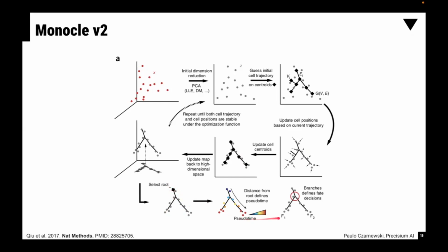And from there, pseudotime is just calculated as the distance of each cell to the starting point that you set up. So this is the distance, and then this is the distance as colored there. It's simply a distance to this original point. And in some cases, some algorithms already do the branching automatically, but there is always a point where you can tweak that to fit your data better. And there are always lots of parameters that you need to optimize to fit your model. So many of these methods are still very biased to what knowledge and what model you want to extract from your data.